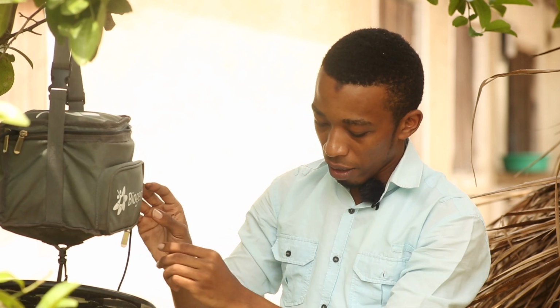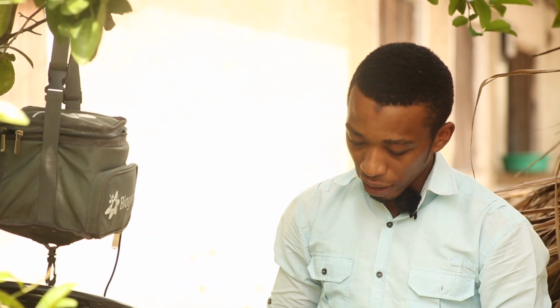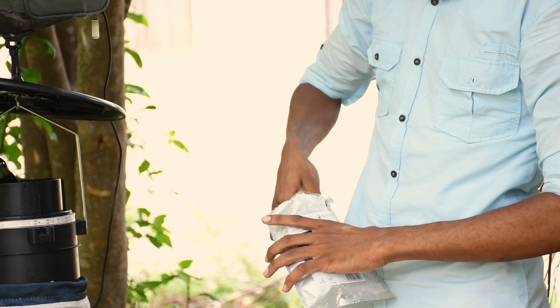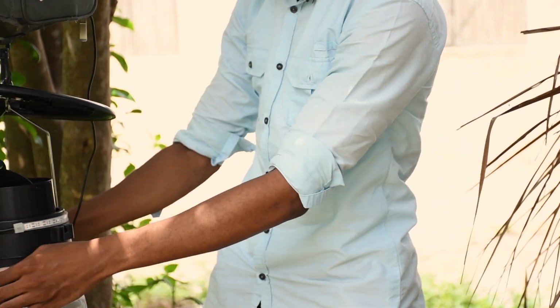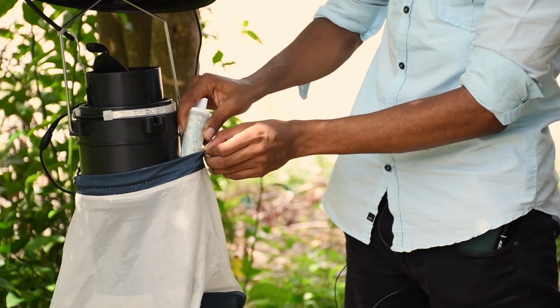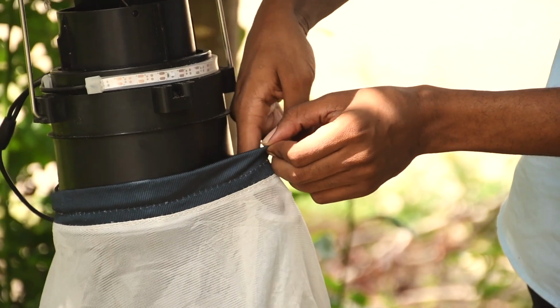And we have the BG lure right here, which is a mosquito attractant used to trap this specific mosquito species. So we place the BG lure inside the net. The BG lure has unique characteristics that allow it to imitate the scent of a human body.